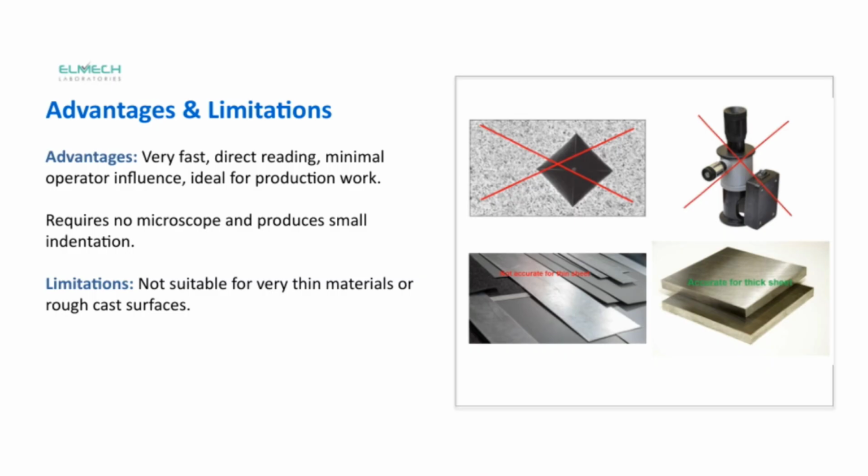Now, moving on to the requirements, you'll be pleased to know that this method requires no microscope, which simplifies the setup and makes it more accessible. Additionally, it produces small indentations, which means it's less invasive and more suitable for certain applications.